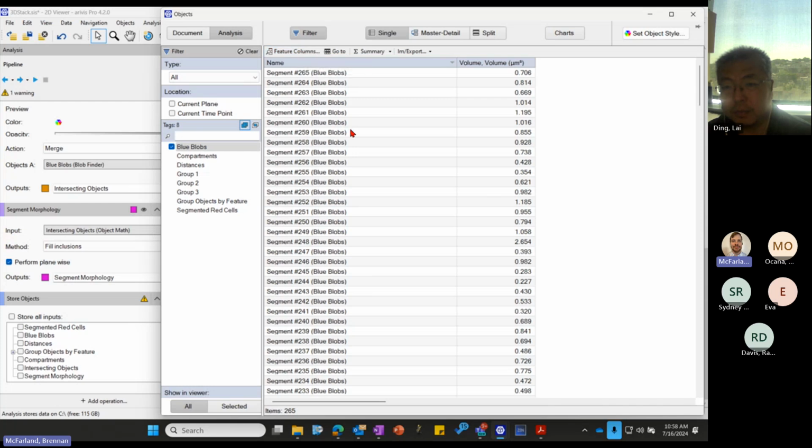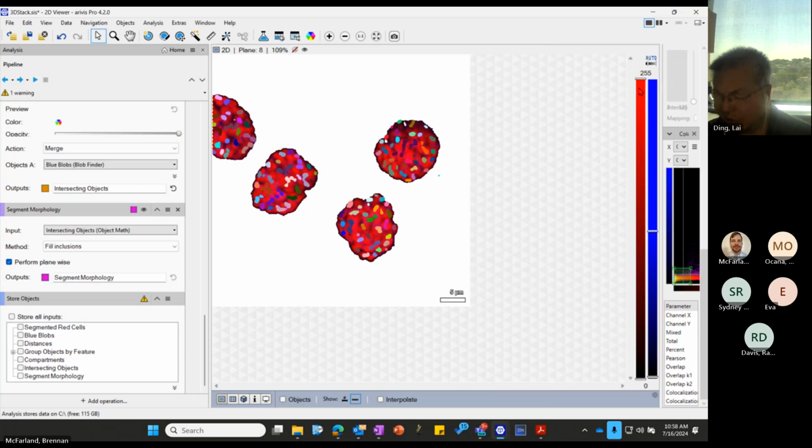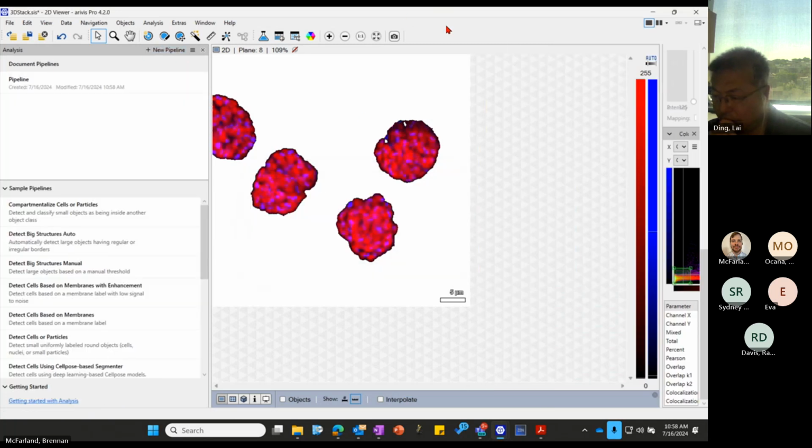Does anybody have any questions? We can stop it here for today. Because we have a lot of time left over from last week, from today, and from Thursday, we can plan additional days in the future, maybe after our meeting Thursday. We can wait a few more weeks and see, after some members have played around with it, and if there's one area that's not really clear, we can create a new training session based on that too.